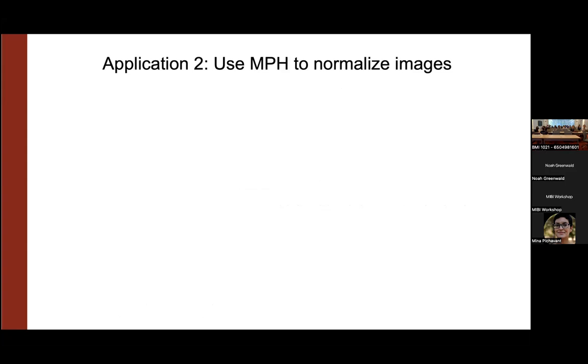Okay, so once you have your image data, which now is somewhere between 50% and 100% of the max signal, what are you going to do with it? If that was the end of it, then you'd have a huge problem because you have a lot of batch effects in your data. You say, oh, look at all these differences, but now, depending on when your image was acquired, your bright marker would look 50% dimmer compared to the max. What we can do though, because we know the relationship between MPH and signal, is directly use that to normalize the images.